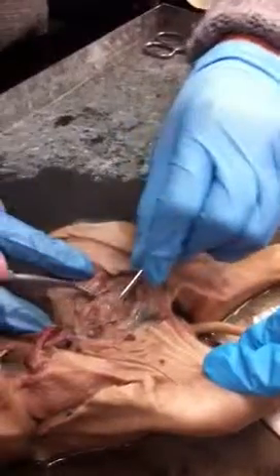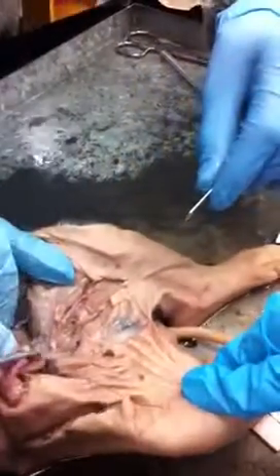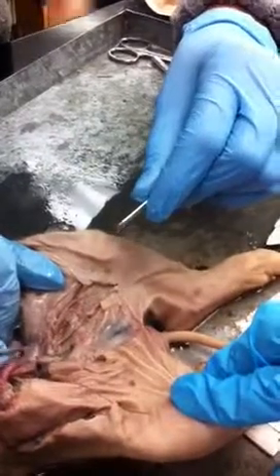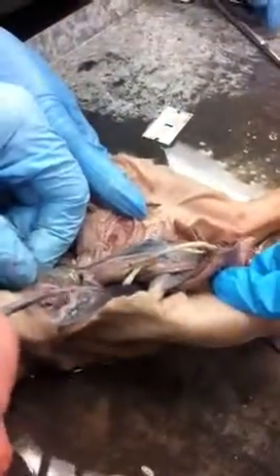So that little white thing might be the collapsed vein, or this might be the, no, that's a muscle there. Okay, so let's look over here. Follow this one up. You guys don't have to know the femoral, right? That's too far. I don't remember seeing that word. Okay. So that's not going to work because it's not injected. So I have to do it the old-fashioned way and actually find it.